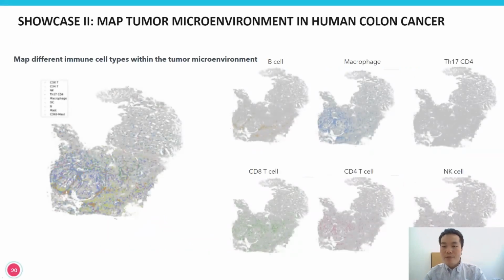These are some of the things that we started to see with just a few genes. But since this measurement contains 417 genes with single cell resolution across the entire tissue, we can again perform cell clustering analysis as I just described a moment ago and identify different cell types within the tissue. For example, here this is showing all the major immune cells, including B cells, T cells, NK cells, dendritic cells. And again, the spatial distribution of these different immune cells are illustrated on this slide.